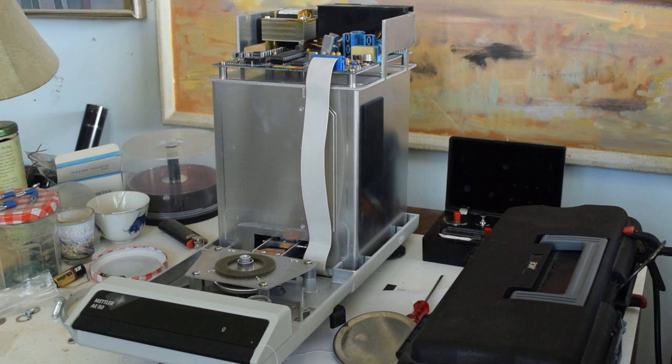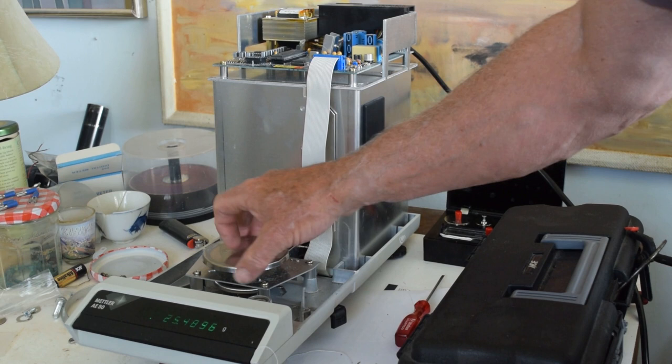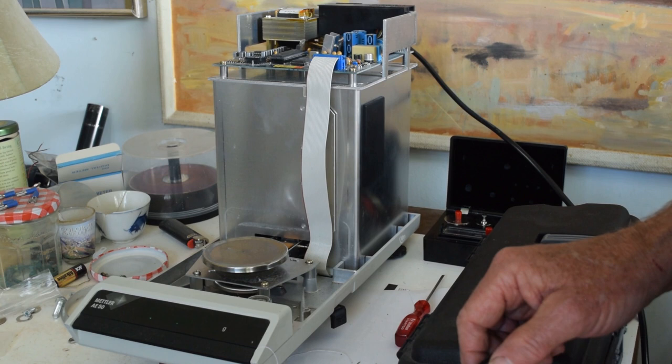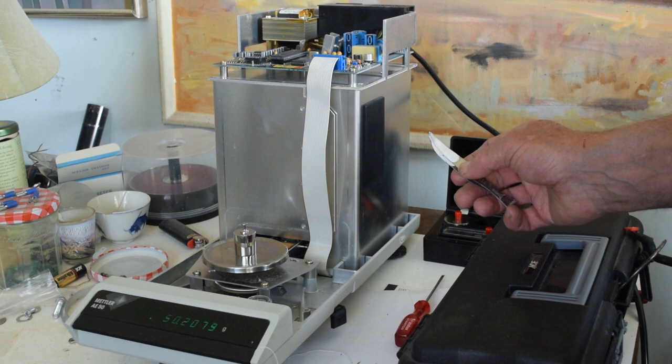You can plug it in and do your test quite effectively this way. Just turn it on, and zero it. There's the zero, and you can set a test weight on there — this one reads fifty point two zero something.